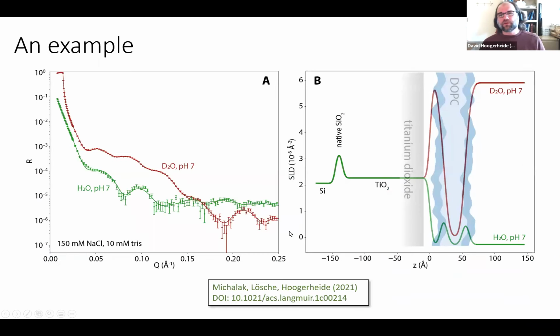So as an example, of course, for this audience, I don't need to describe what reflectivity is, though there are some differences, of course, between the way you would do an experiment in the X-ray case and neutrons. So this is an example of a fairly straightforward soft matter sample that we would do reflectometry on at NIST.